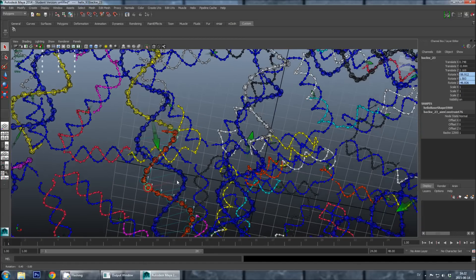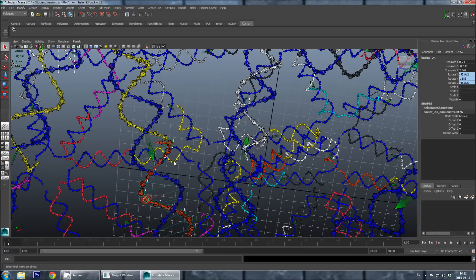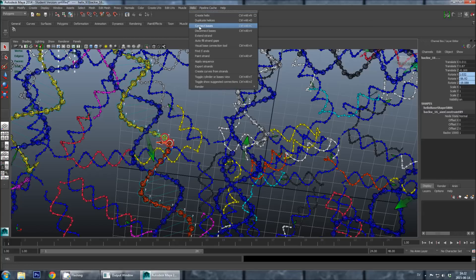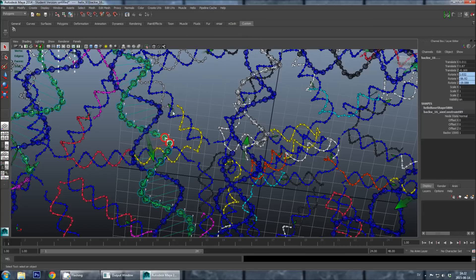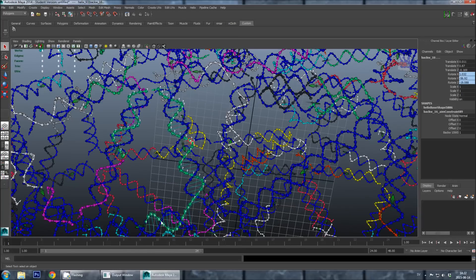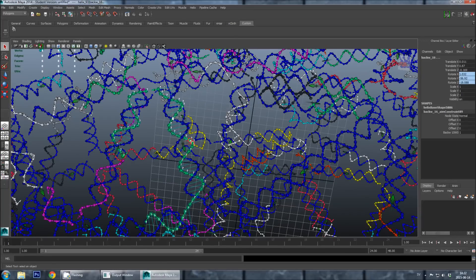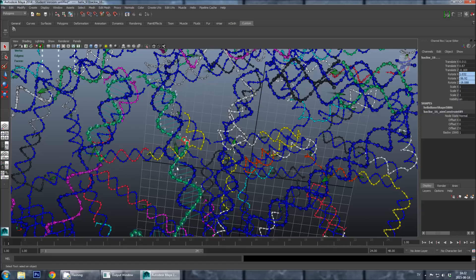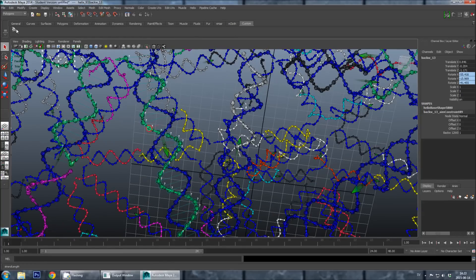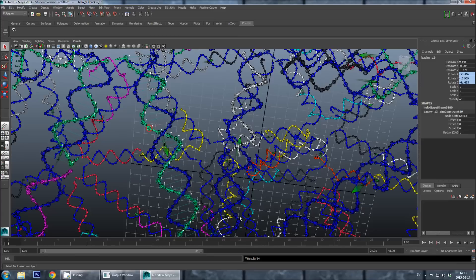What we have to do then is first selecting the last base of the red strand, and then with shift, selecting the first base of the yellow strand, and then we go into helix, connect bases. So now we have removed the breakpoint between these two staples, and joined them into one long staple, connecting to three edges. And now we can see how long this strand is by using our new button here, and it turns out that it's 64 bases long.